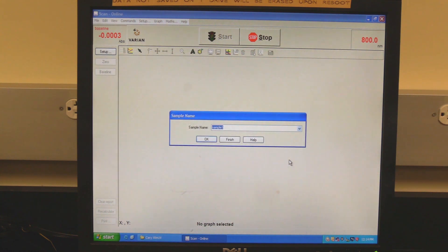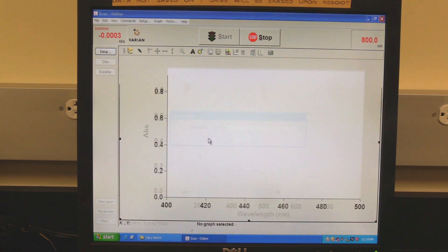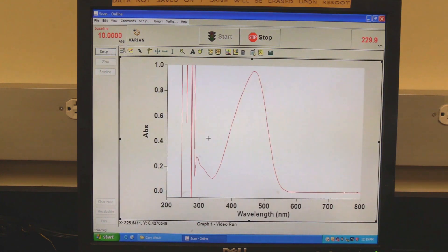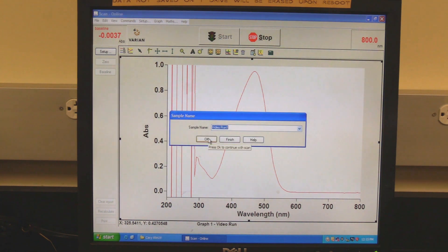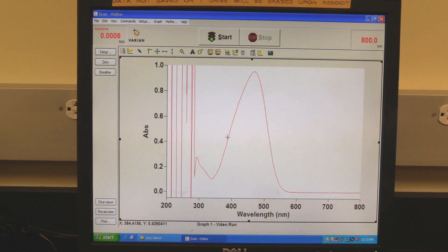The software will prompt for the sample name. Click OK to start the measurement. Wait for the measurement to finish. The spectrum will appear. The software will prompt for the next sample name. If measuring another sample, click on OK. If finished measuring samples, click on finish.